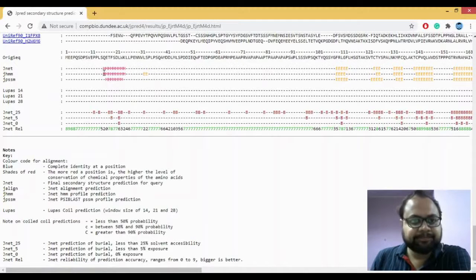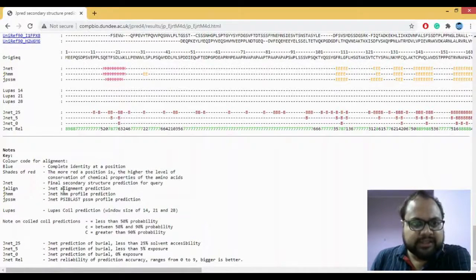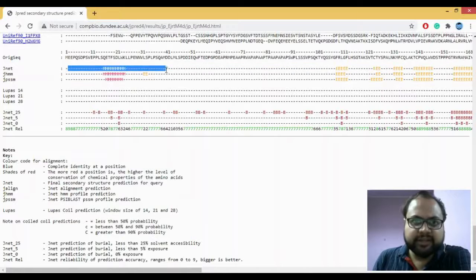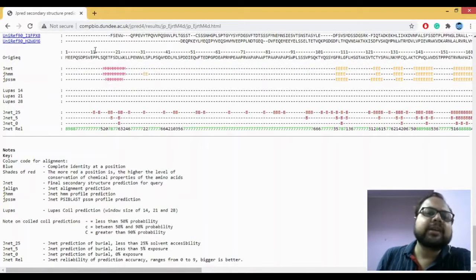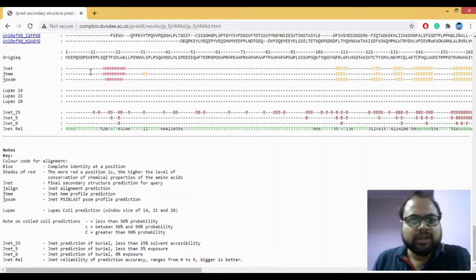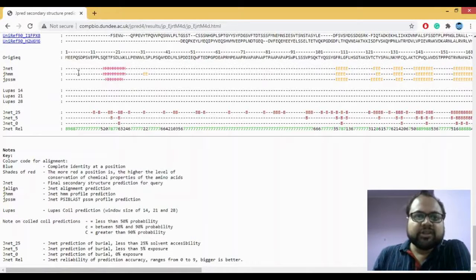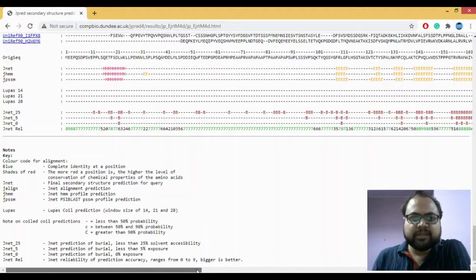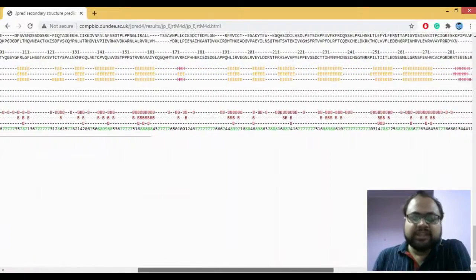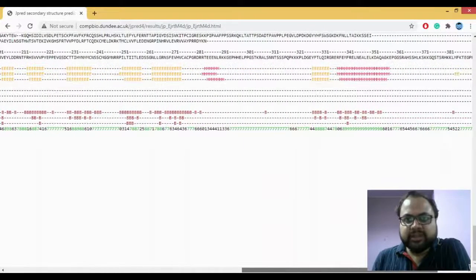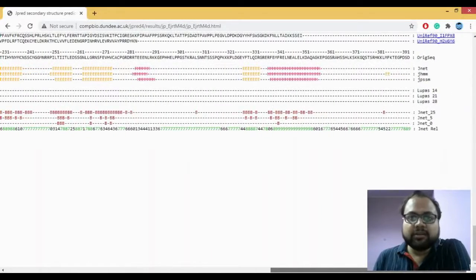The JNet row here is your final secondary structure prediction. A dash here stands for coils. The H in magenta stands for helices, and E stands for beta sheets. So: dash is coil, H is helix, and E is beta sheet. The JNet gives you the overall view of how your final secondary structure prediction is going to look.